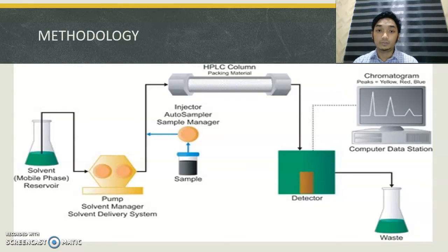Hello, I'm going to explain the methodology. This diagram shows how to set up the high performance liquid chromatography.